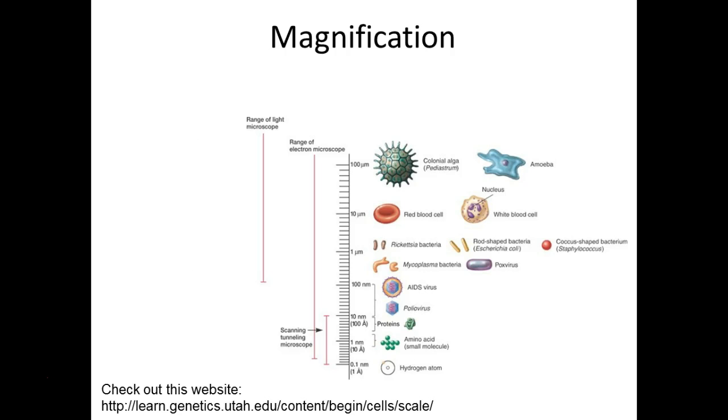The magnification is pretty simplistic. We don't actually make the organism bigger. The image appears larger, so we're able to visualize it more easily with the natural lenses in our eyes. So we use additional lenses, or in the case of an electron microscope, electrons and a computer to interpret those electrons and the difference in movement based on the different things they pass through.